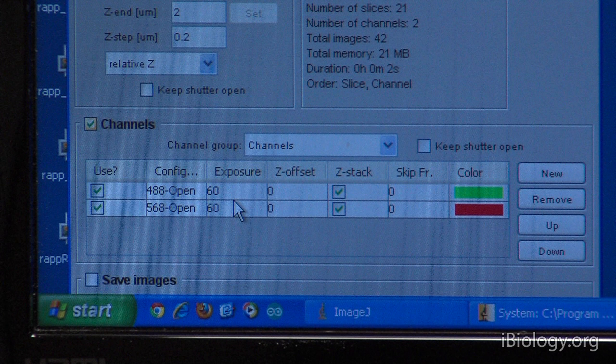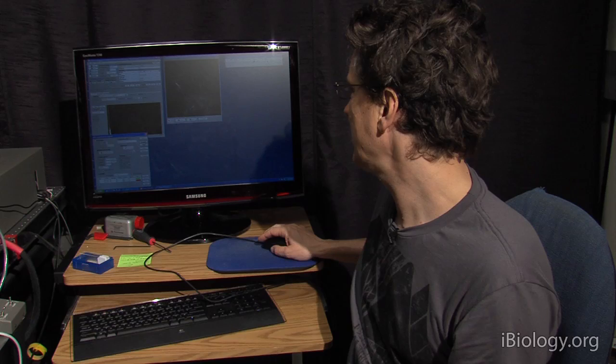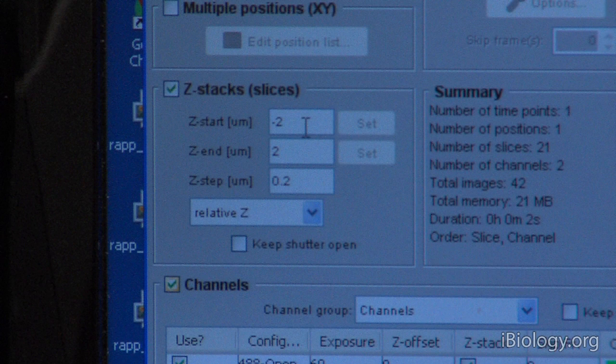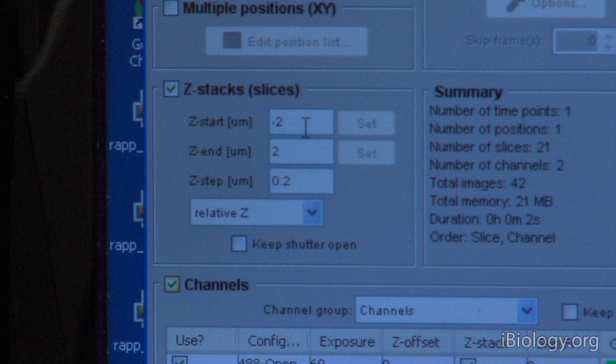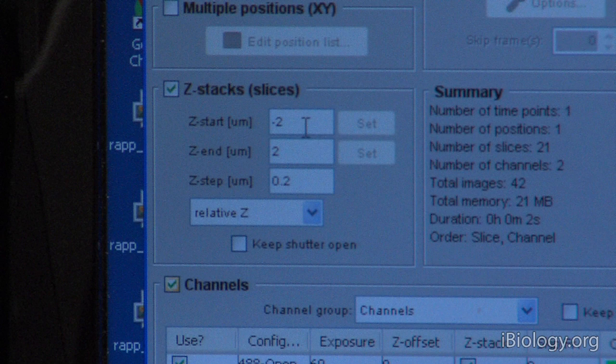So I use here configurations that don't do any of that. And then when I now press acquire and I'm asking here for steps of 0.2 microns from minus 2 to plus 2, so this is a total of 21 slices in two channels.